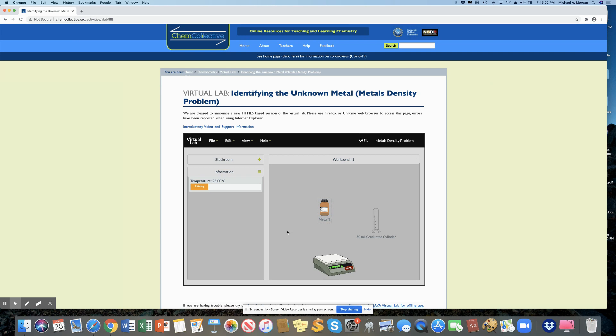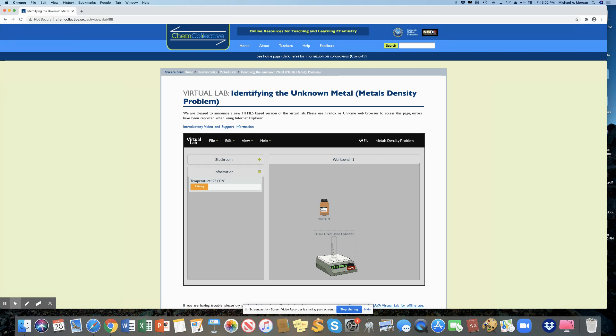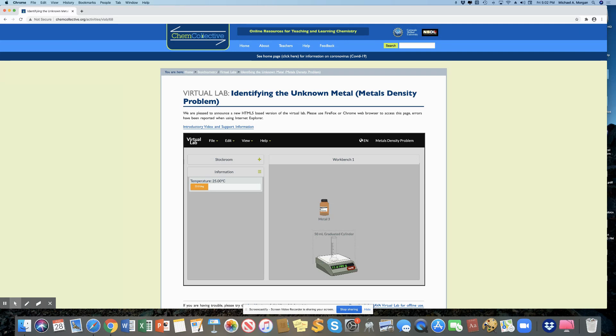So your first step in doing this is finding the mass of the empty graduated cylinder. So I put the cursor on it and I drag it to the balance until I see that nice little green plus show up there. And when I get it on there, I'm going to write down what that number is. And it's 72.6706 grams.